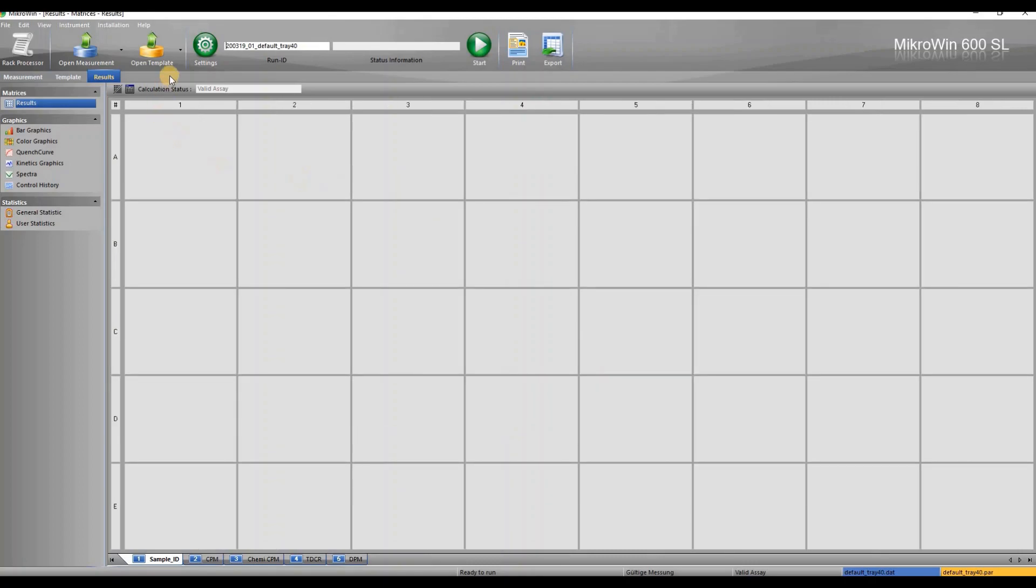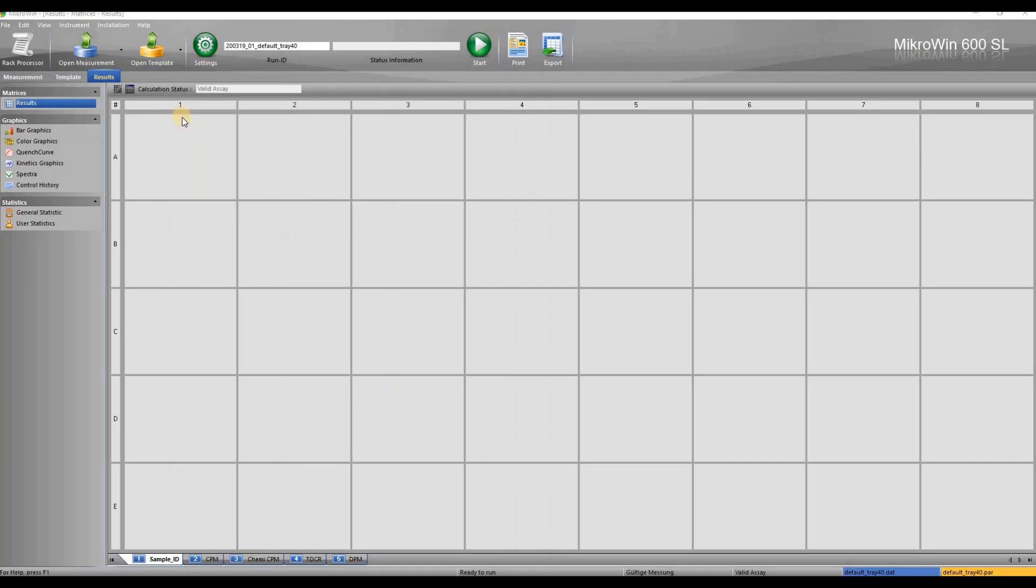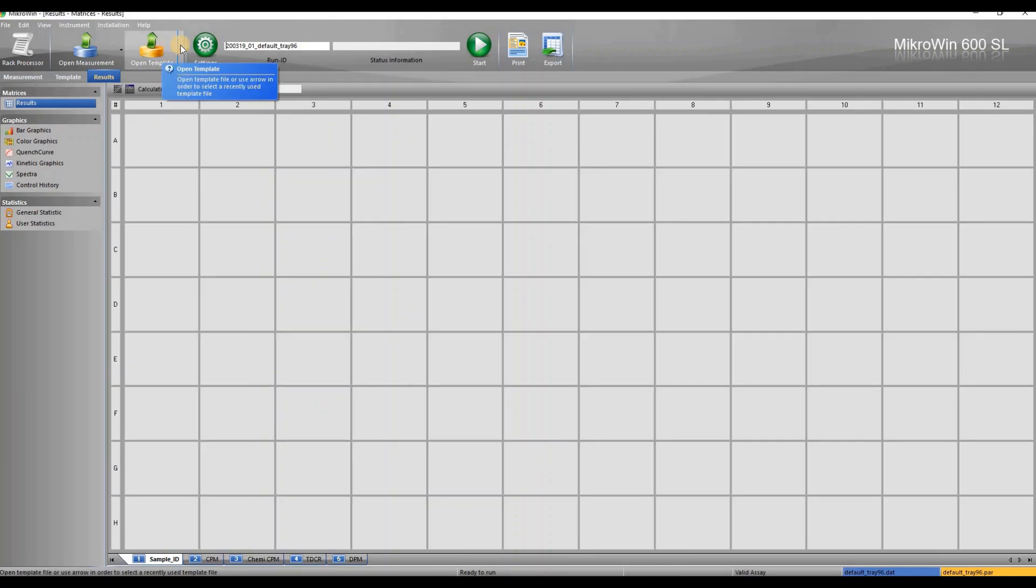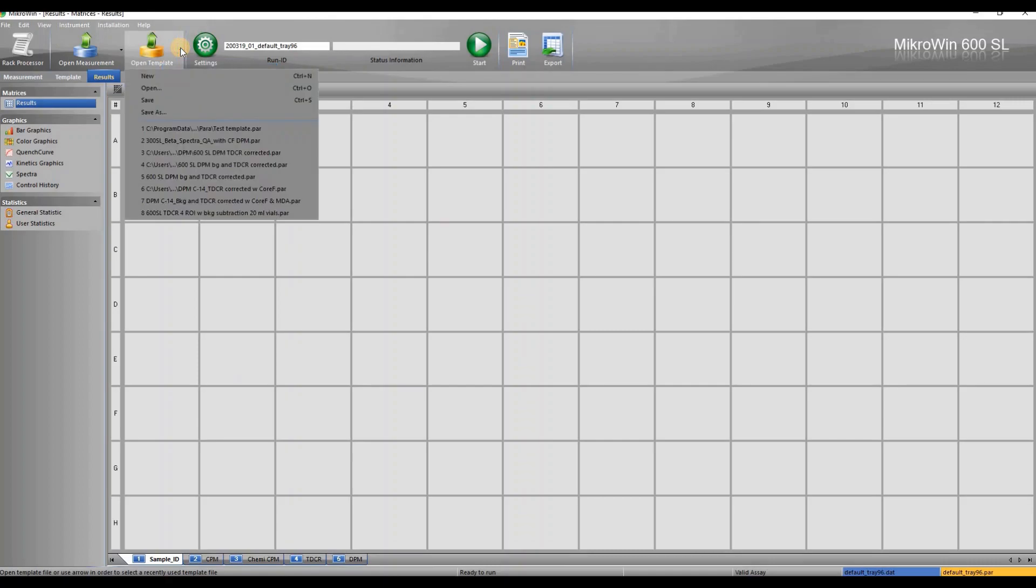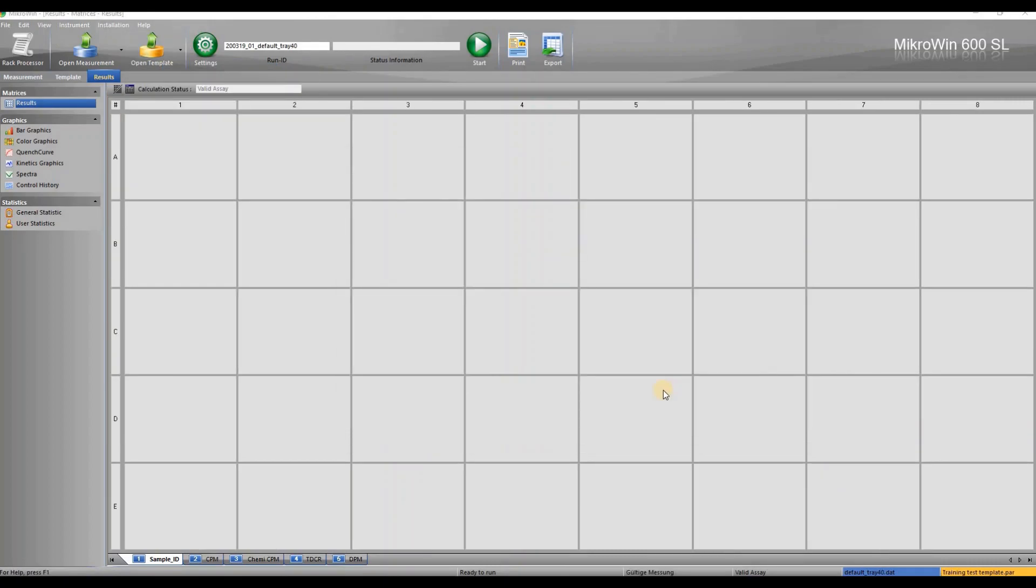We can now save our template under another name. It is best not to make any changes to the default template. You can now see that the template name has changed in the bottom right corner.